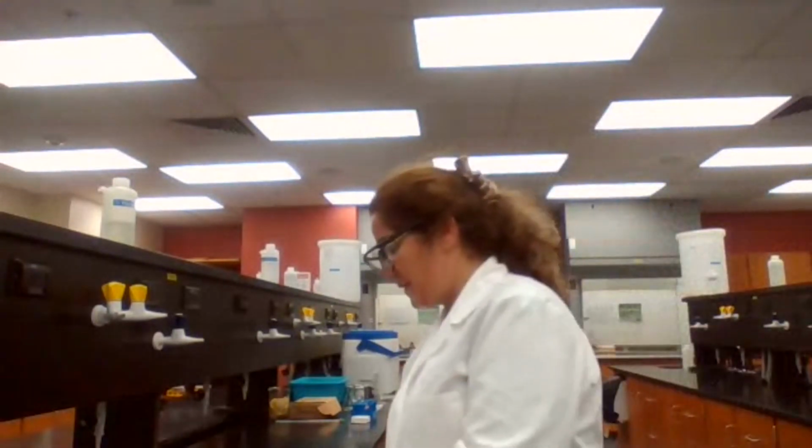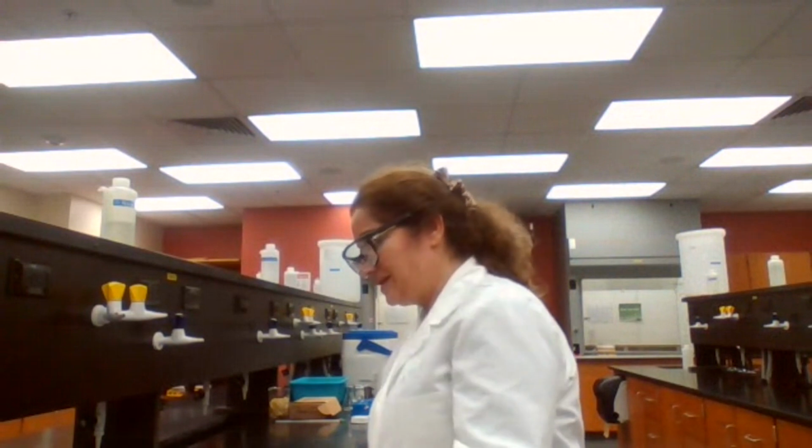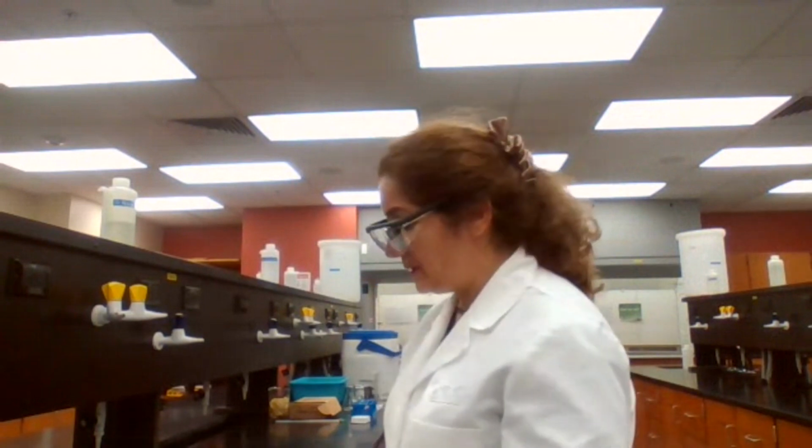Today we are using melting point because the melting point for the ortho product and para product is different from the meta product. If the compound melts within the range that the compound with the meta substitution is going to melt, then you can identify and map it back to the product being meta, just like experiment 12, where you used the melting point to find out if you have 2, 3, or 4 chlorobenzoic acid. So we learned about 2 experiments already, that they were supposed to be under reflux because they required high heat.